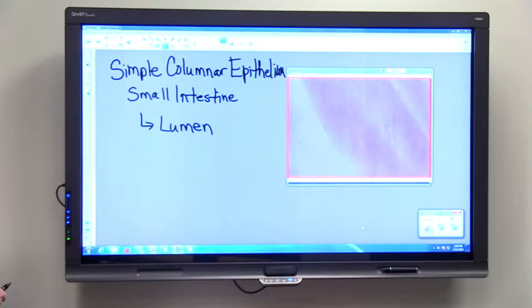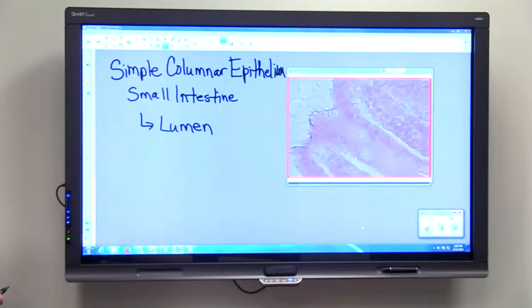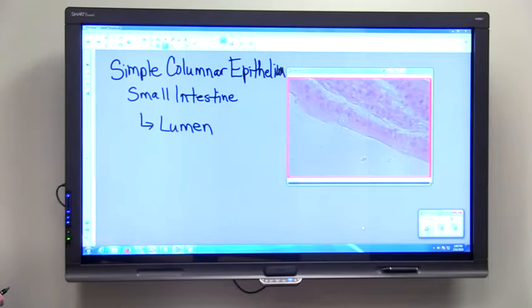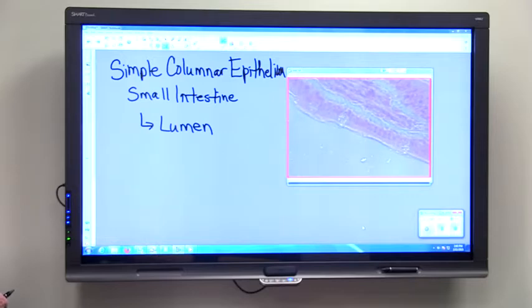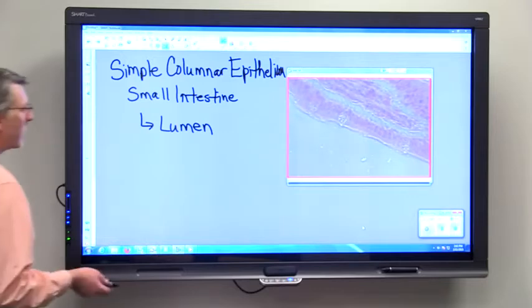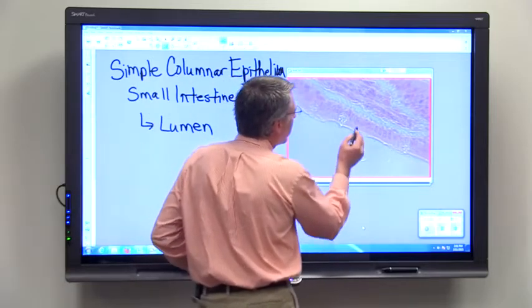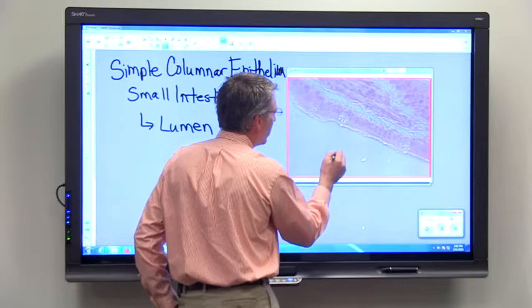Let's scroll around and see if we can find another area where we may be able to see the nuclei a little better. Again, this is all about how the slide is made. When this slide was made, a small intestine probably from a mouse was actually cross-sectioned. Here you can see the tissue a little better. This is the lumen.